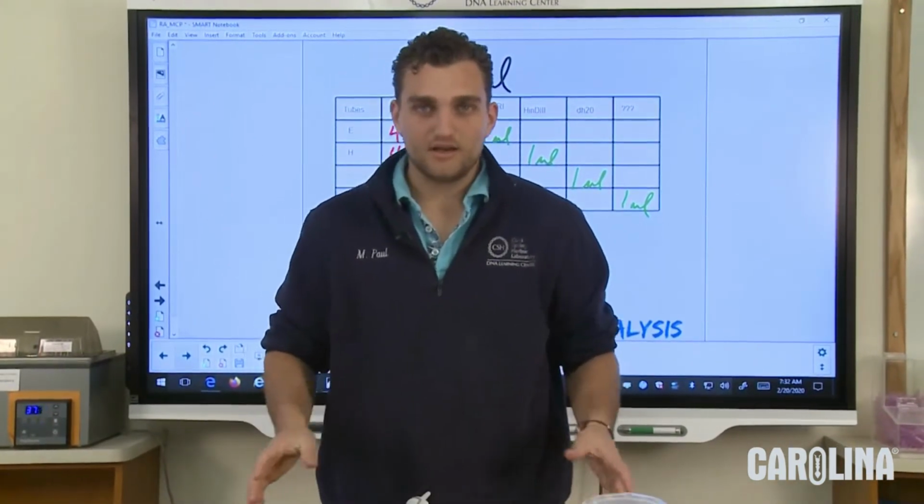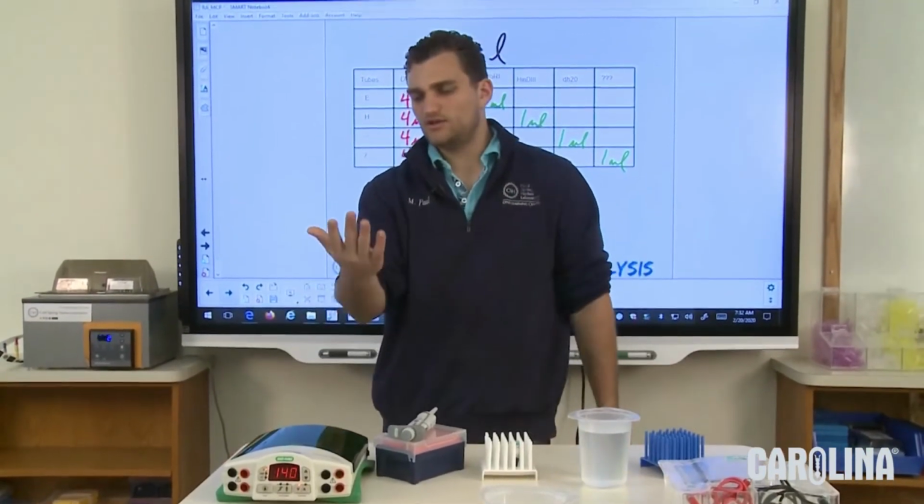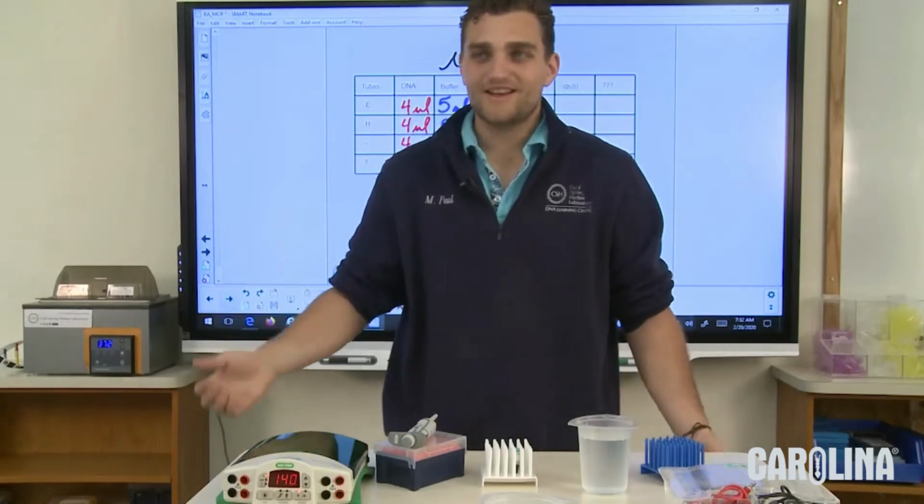While I'm doing that, I'm going to ask you a question. Can we simply see DNA? If you're just looking at it, can you just see DNA? No, right? No.